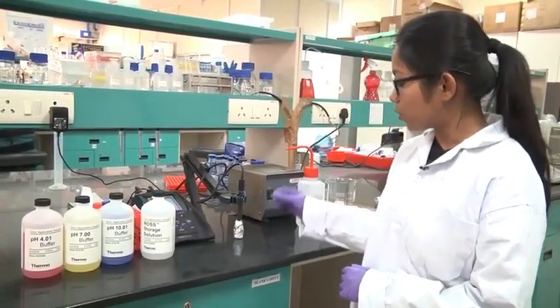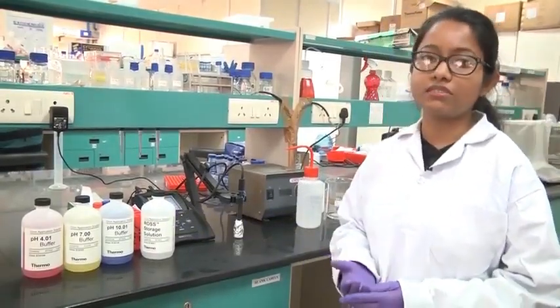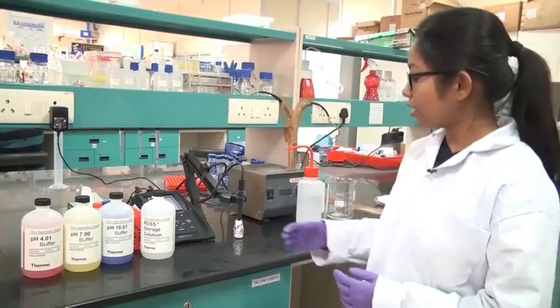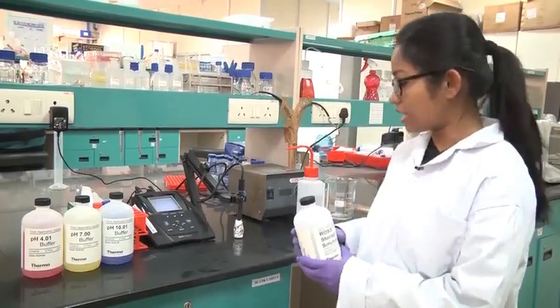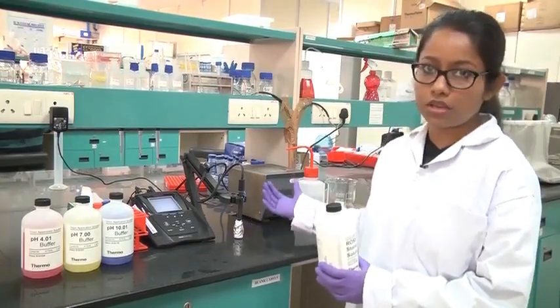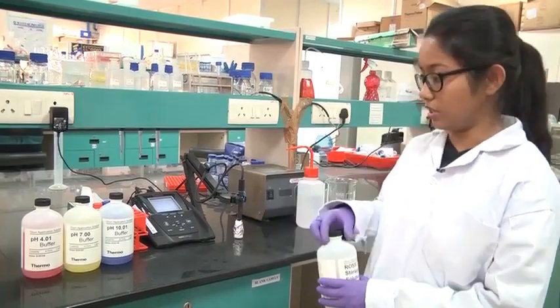Keep in mind that the probe should always be moist, otherwise if it becomes dry, it will damage the probe and you will not get accurate results. From the storing solution in this big container, I have taken out a small volume and kept it in a small container, and for storing this probe for a long time, I have kept the probe dipped inside the storing solution.